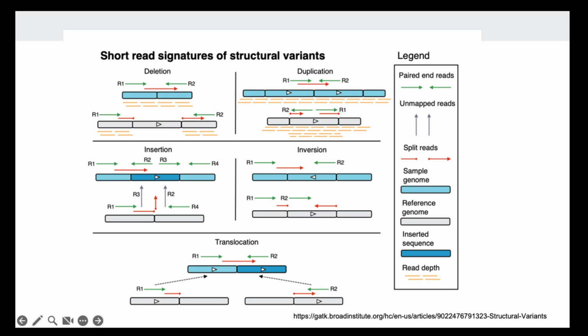If there is an inversion, then this is more tricky because the sequence will flip, like from 5' to 3', it will be the reverse complement of the sequence. So if you don't have the sequencing data exactly at the junction, where the inversion occurs, then everything will look normal. Because reads that map to the middle here that now became inverted, you thought that might be the reverse complement strand, and you can still map it back to the genome.